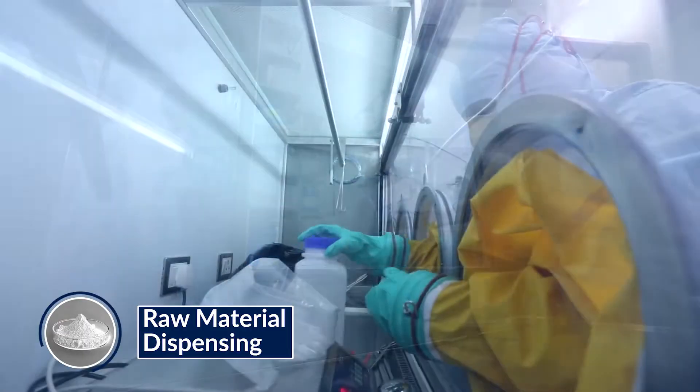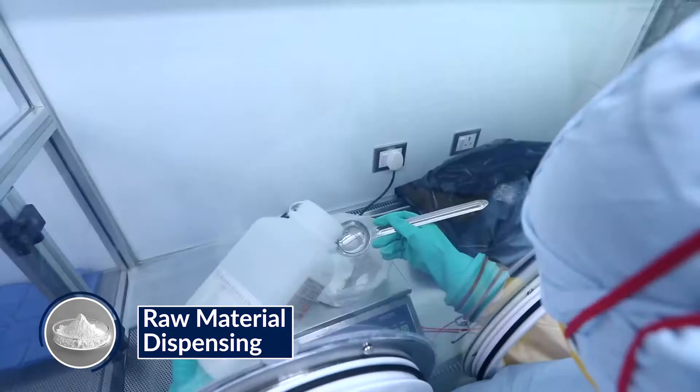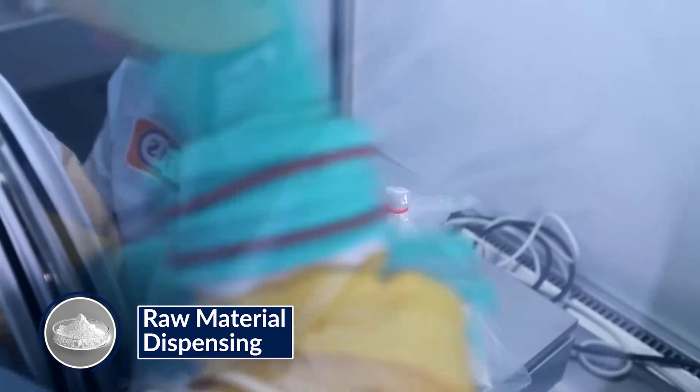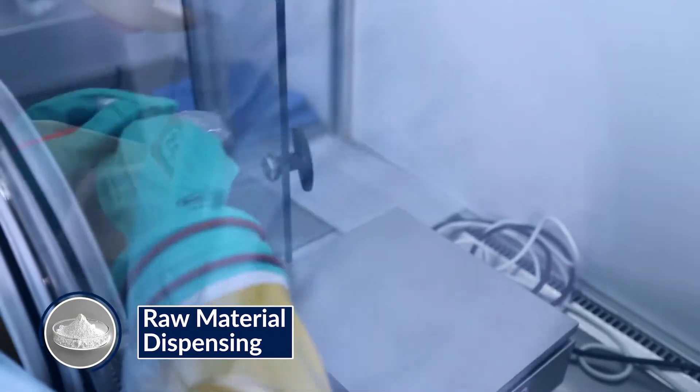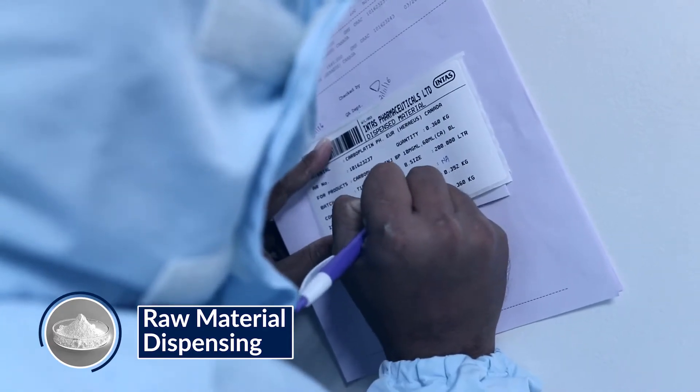Raw material sampling is done in a micro environment. After QC approval on sample, the material is passed through air showers and a vacuum chamber for cleaning. The selected samples are barcode fitted to ensure the correct sample is processed.